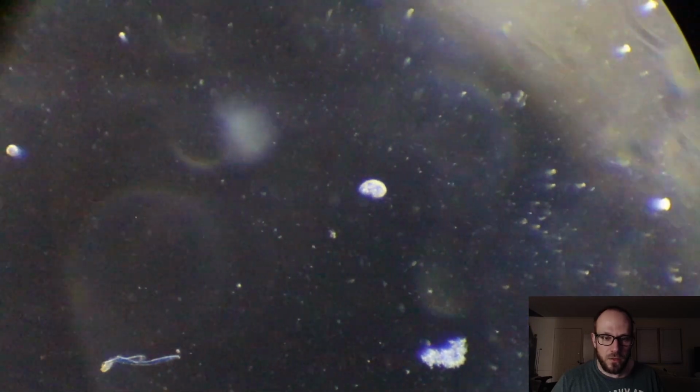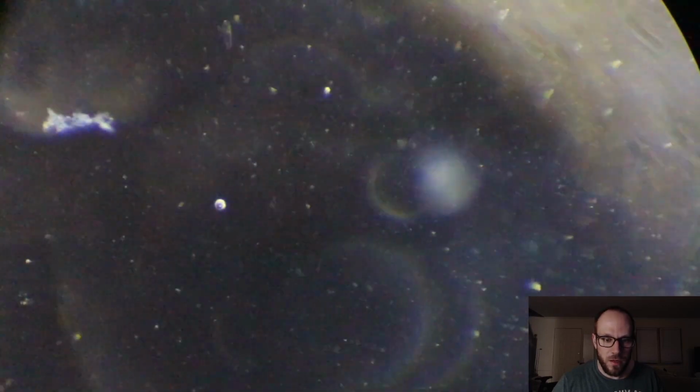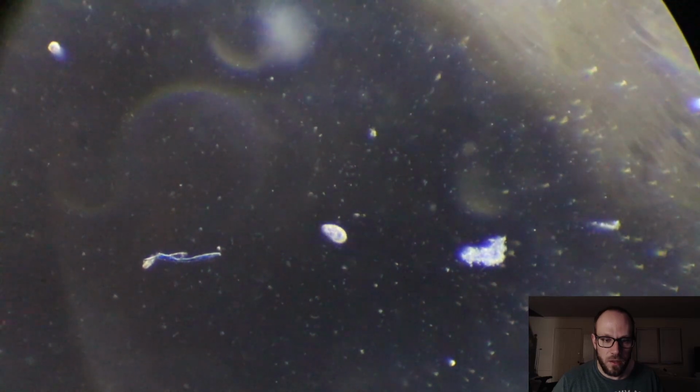It's just kind of cool that in this tiny little slide on my microscope, there's this dude swimming around, couldn't even fathom of the world outside of that little drop of water that he lives in. But yeah, look at all these guys just swimming everywhere. They're so small.